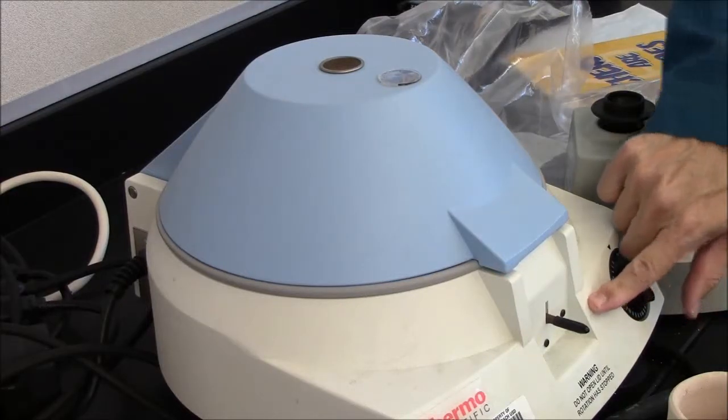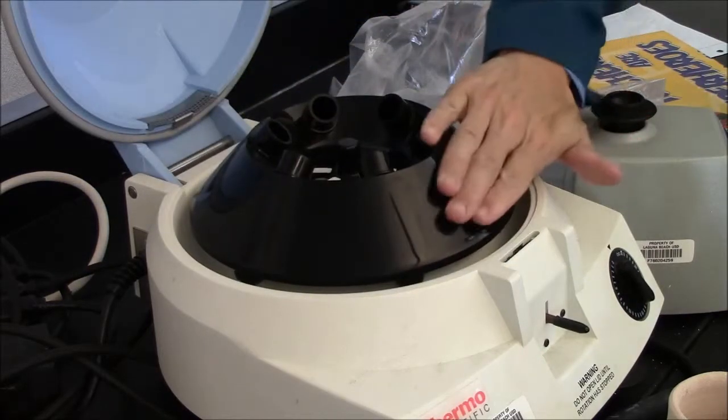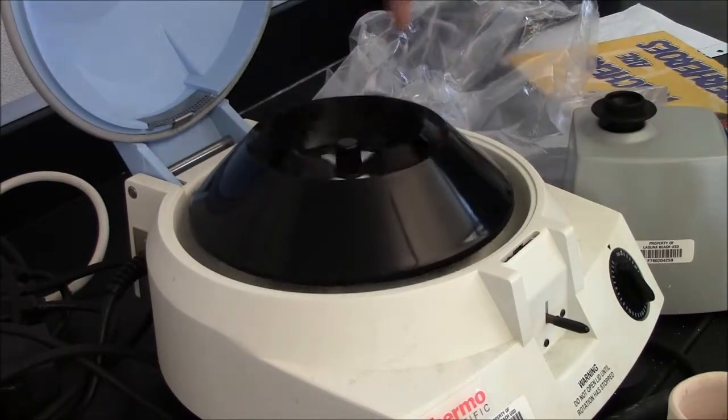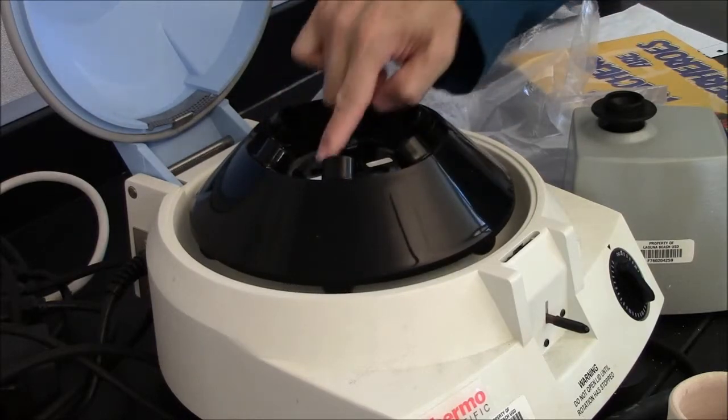This is a centrifuge. It has a lever here to open. Inside is a rotor which can spin. There are six slots in which you can put test tubes.